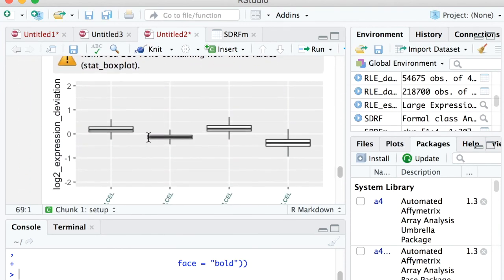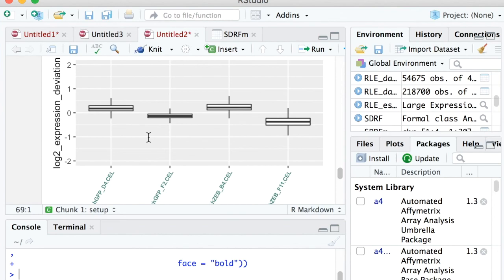And then we scroll down to the bottom of the code where all the generated figures will be. And again, we can see something that's consistent with what we saw in the box plot earlier, which is saying that aggregate intensities for samples in this data set are pretty consistent. So we don't actually have to get rid of anything. But let's say the aggregate intensity for this sample is over here, then we might want to get rid of it because it's significantly different from zero.